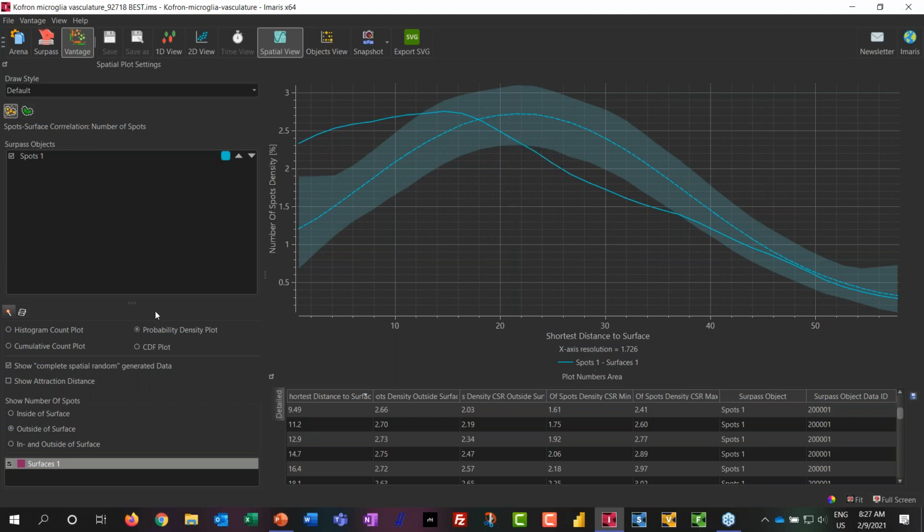And so I do like to see that, and then you'll often see that the attraction distance that we label for you to help you understand what's happening in your plots is often very close to where that crossover is. But it is based on the raw data that you see in that histogram plot before any smoothing happens.